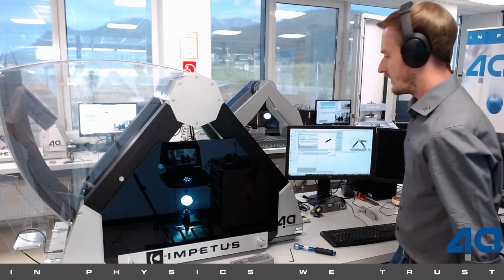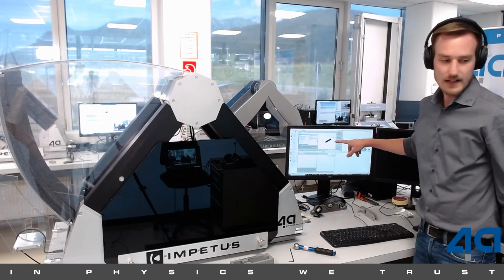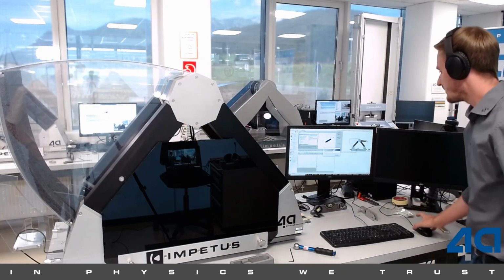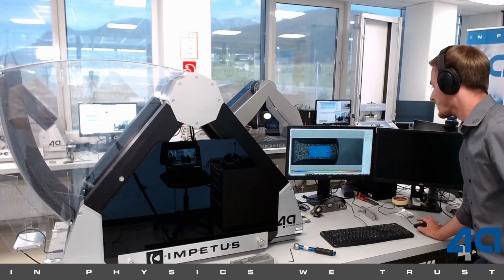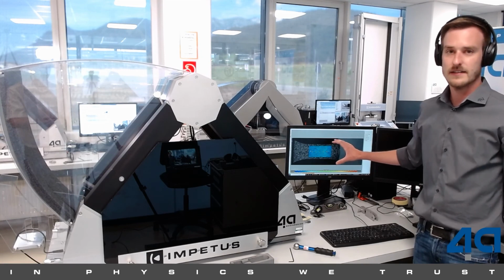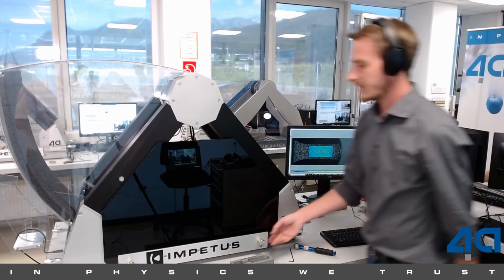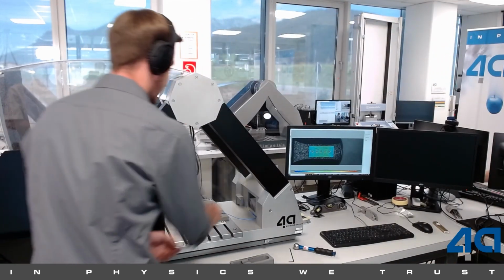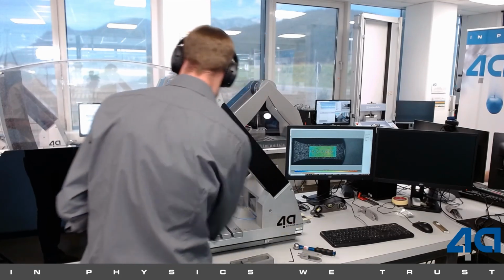Here was a light flash. The test was performed. We are downloading the images directly, as you can see. The images were downloaded. In the background, Mercury, the DIC software, is automatically calculating the DIC strain measurement field, as you can see here. This is done within a few seconds.